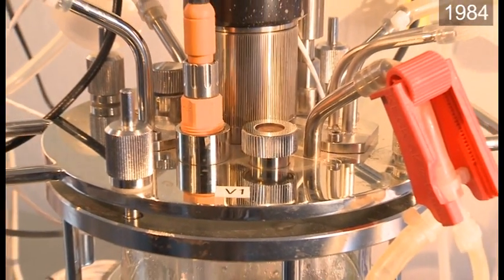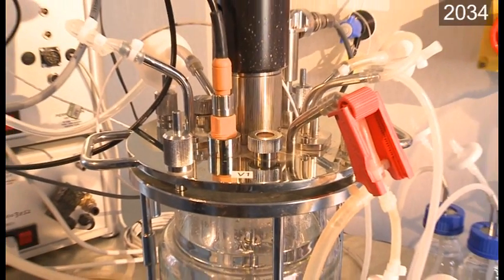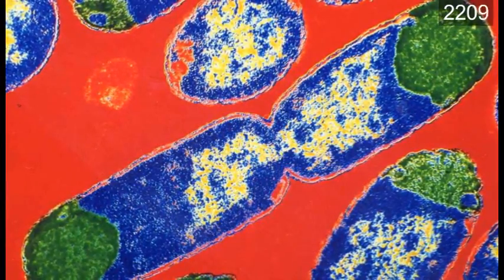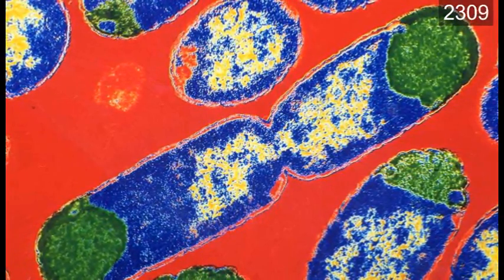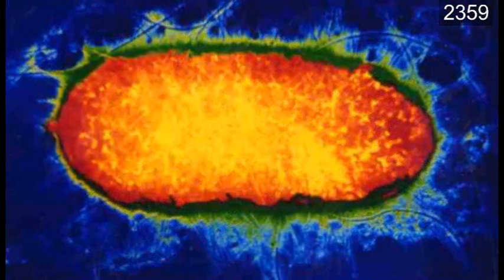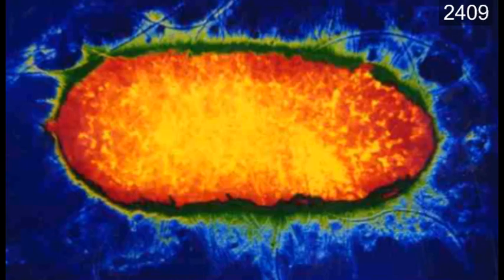The types of organisms we can grow are both aerobes and anaerobes. For example, for aerobic organisms, principally we'd look at E. coli, which would probably have a recombinant product within them, although we also work on native products such as Erwinia, which is the source organism for Erwinase.